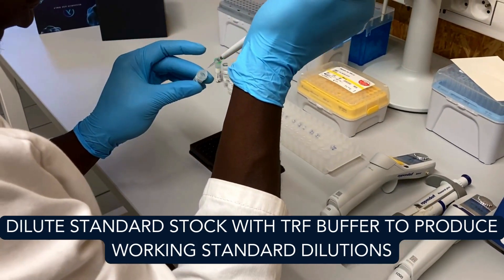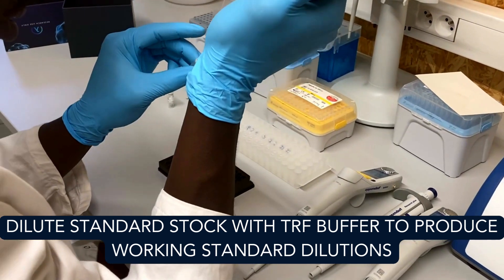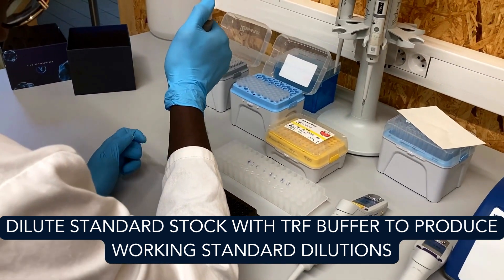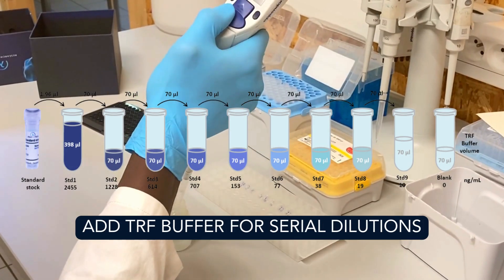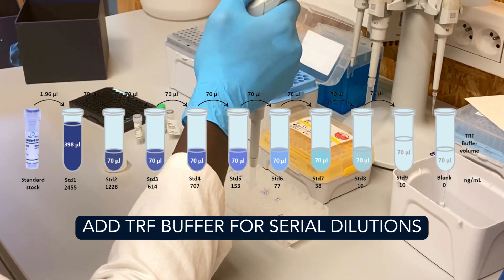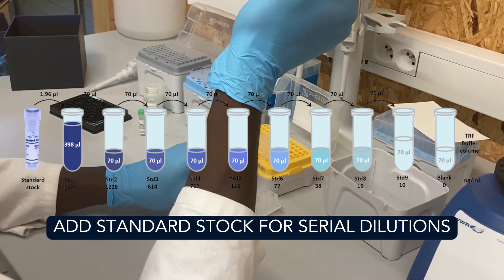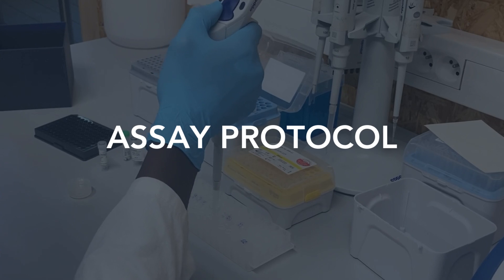For the preparation of the IgG working standard solution, use the standard stock solution to produce a standard at 2455 nanograms per milliliter using TRF buffer as diluent. Prepare serial dilutions for the standard curve as indicated in the protocol provided, adding TRF buffer and standard stock. The diluted working standard solution should be used immediately and not stored for future use.